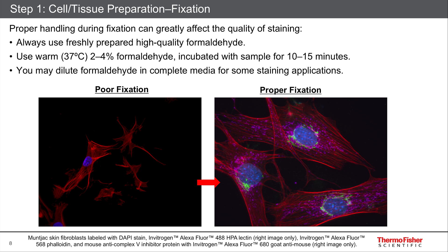On the left, you can see an example of poor fixation, where the cells have a fragmented appearance. These are cells labeled with phalloidin to label F-actin in red. On the right, you can see cells that were properly fixed — a nice morphology and good actin structure. These were fixed with formaldehyde.